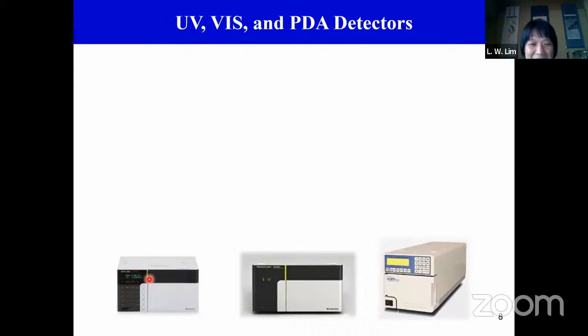interesting also, because they found the method for a mass spec detector. They found a new ionization detection method, which we call TOF, time of flight. Time of flight means the time for the ion to fly to the detector. The name is very funny. They imagine the ions, after being ionized, flying from one side to the other side under vacuum.